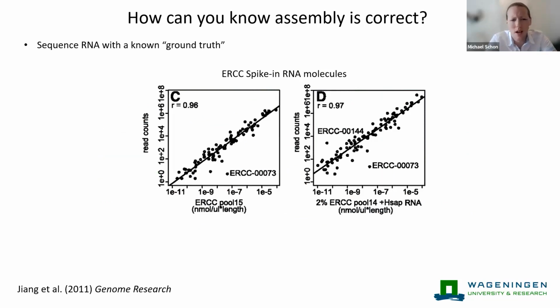And so, these challenges, these problems led people to search for ways to introduce a ground truth to the sequencing experiment. One of the more influential techniques was the idea of synthetic spike-in RNA molecules.